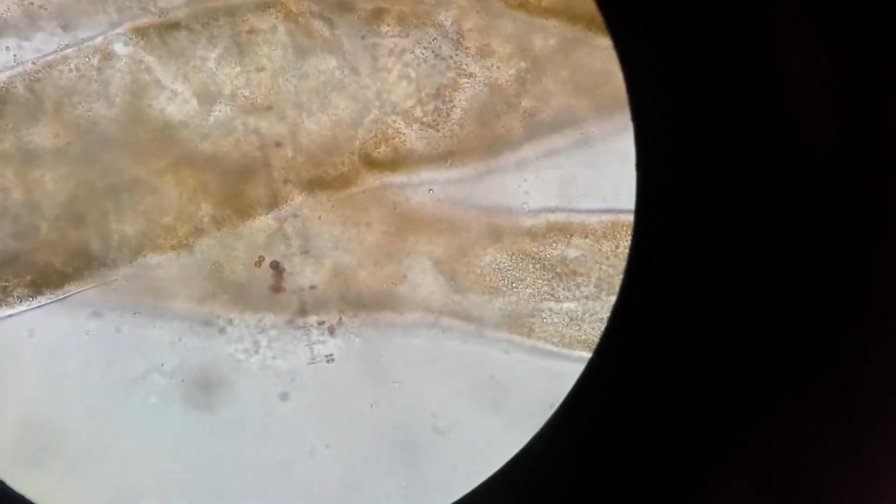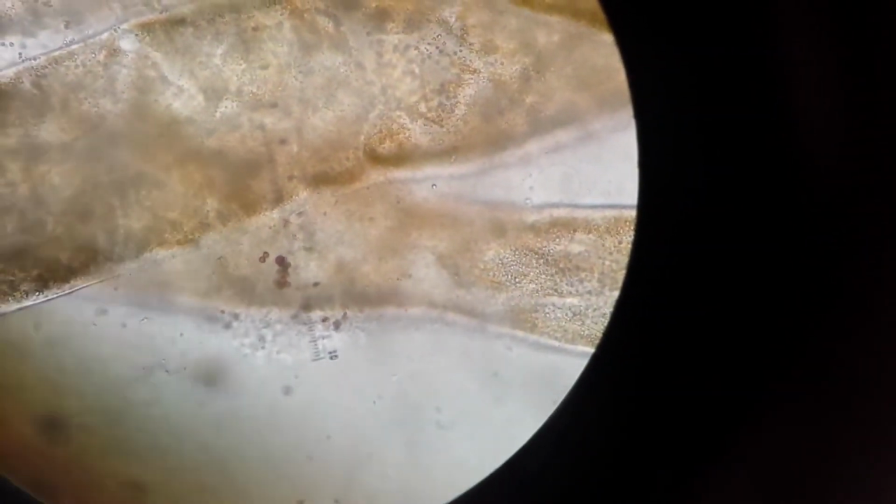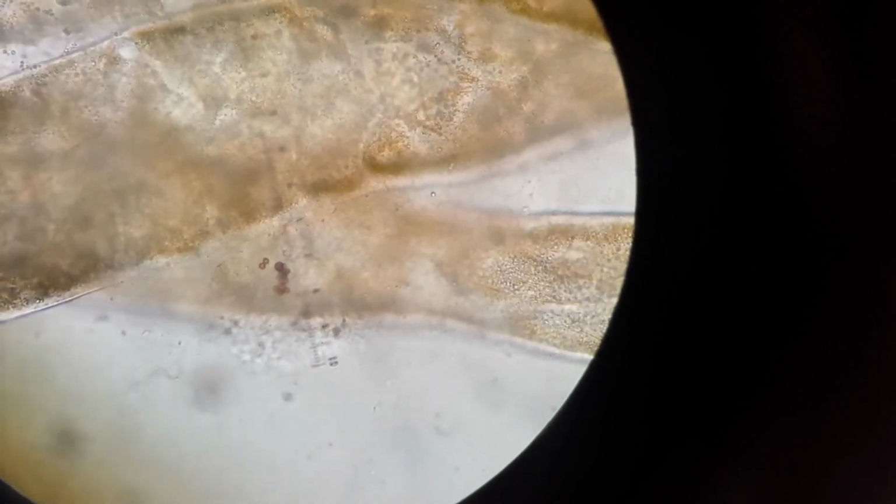So not a whole lot to see here at the moment. If we were live and watched for a few minutes, we'd probably see more. But there you have it. Cricket Malpighian tubules. I hope you found it useful to get a preview for what we'll be doing in lab next week.